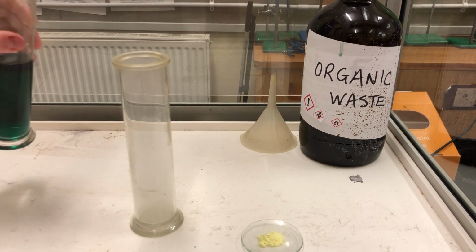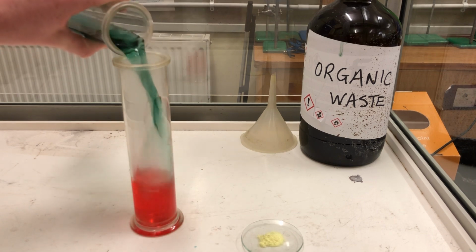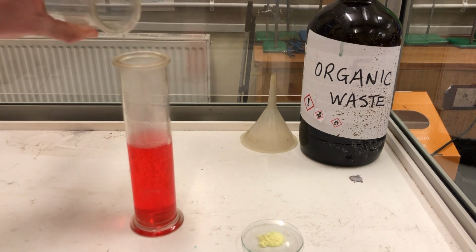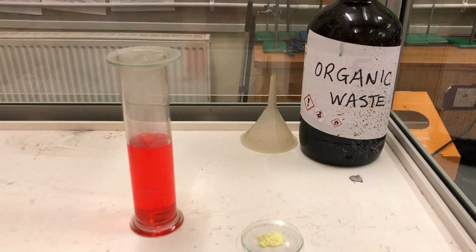This water has universal indicator added to it. It should be quite clear to you that the neutral water, that was the green colour with the universal indicator, instantly turned to this red acidic colour. Sulfur dioxide is an acidic gas.